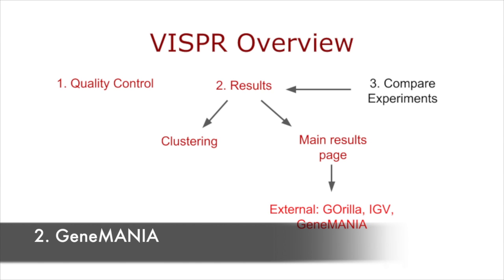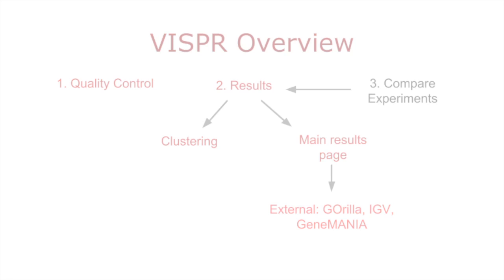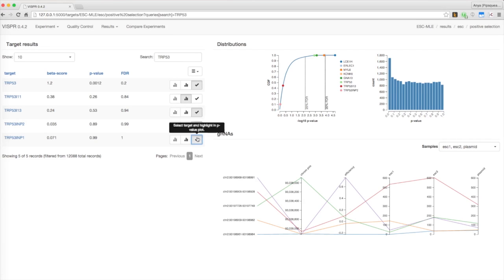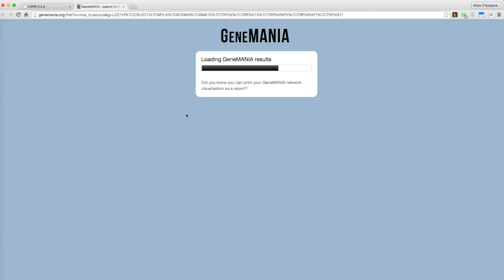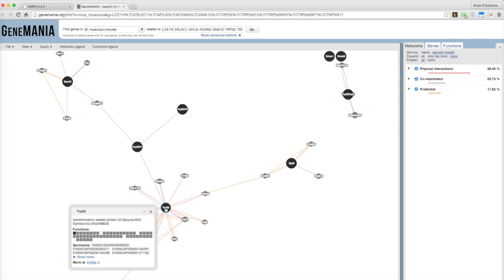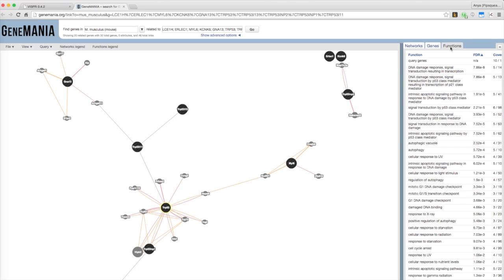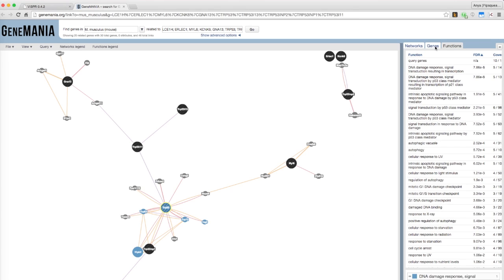Using GeneMania, the interaction network and function of selected genes can be visualized. Simply select a few genes, click Show in GeneMania, and you will be directed to the GeneMania website. The genes colored black are the ones previously selected, and you can explore their functions and other information by browsing the tabs.